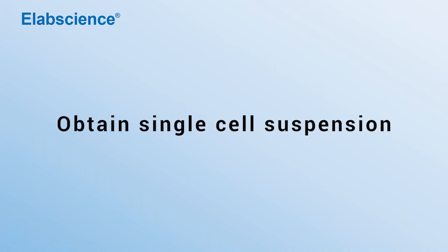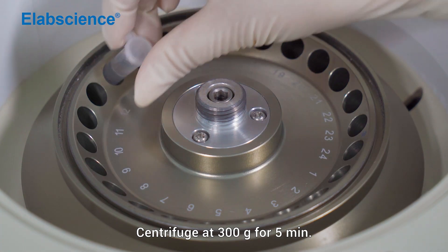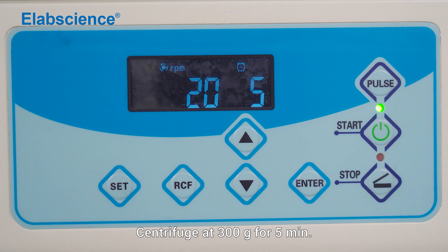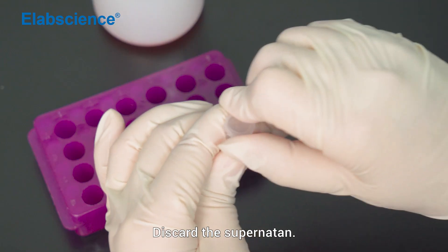Obtain the single cell suspension. Wash once with 2 mL of PBS and mix. Centrifuge at 300 times gravity for 5 minutes. Discard the supernatant.